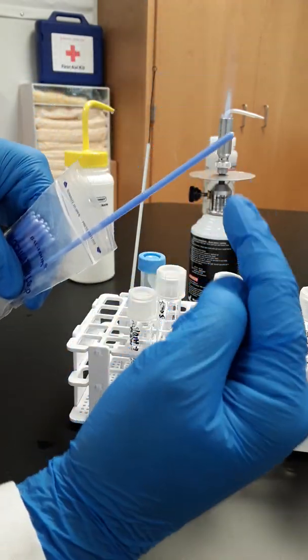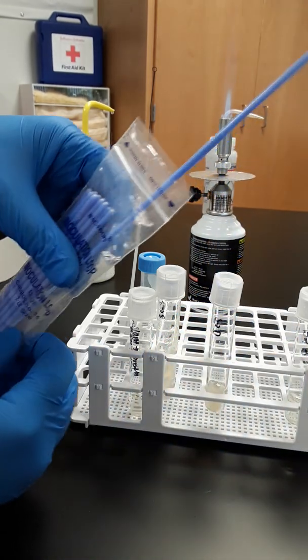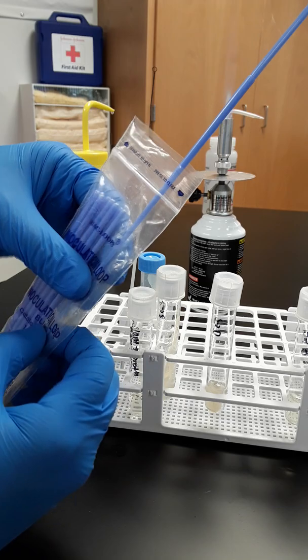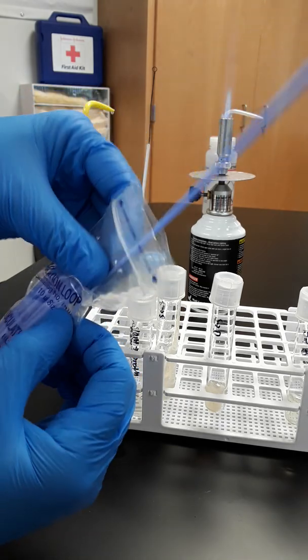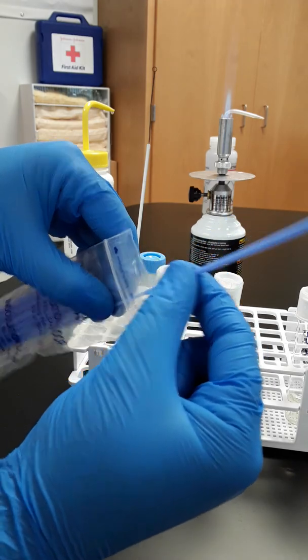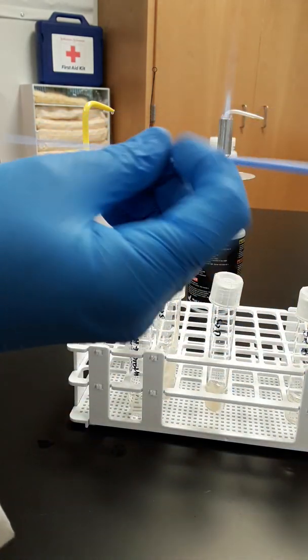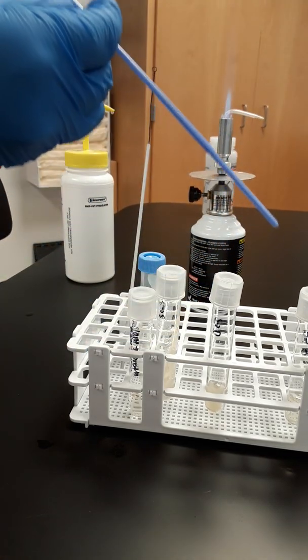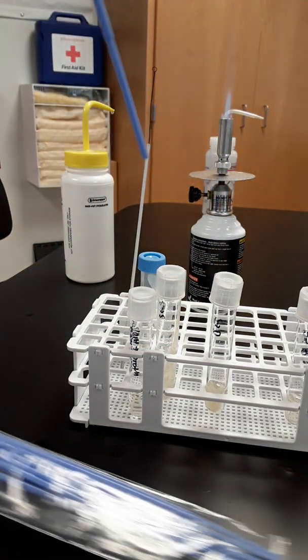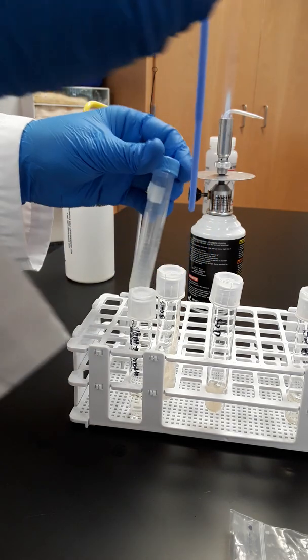And because we're going to be stabbing with this part, we don't want to touch that part. So we want to keep pushing all the way up until we're pretty comfortable that we're at a spot that we're not going to touch. So here. We're going to grab this teeny tiny loop end, and we're going to be inoculating with this big fat end that came out first. So you want to make sure that you don't touch that. If you touch it, you've contaminated it.